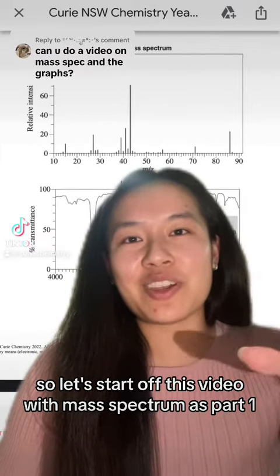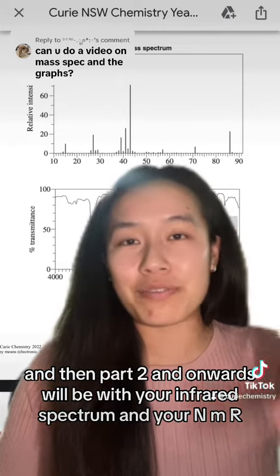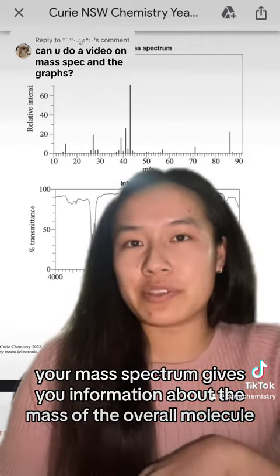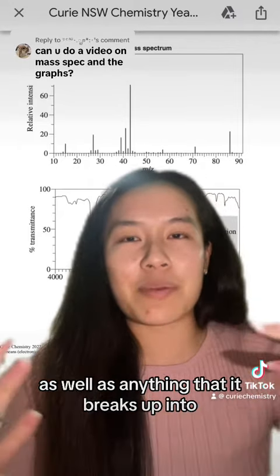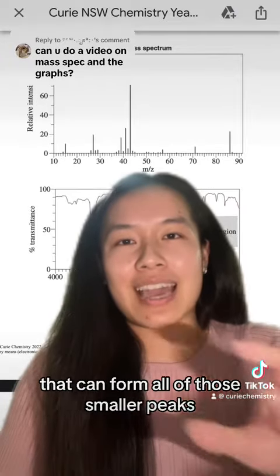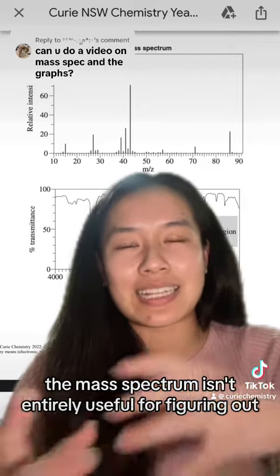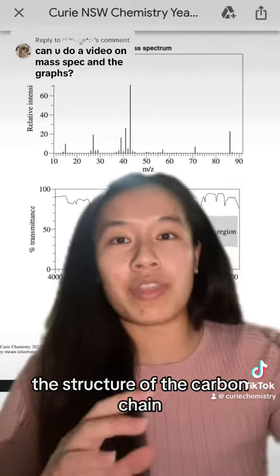So let's start off this video with mass spectrum as part 1, and then part 2 and onwards will be with your infrared spectrum and your NMR spectrum, so watch out for those. Your mass spectrum gives you information about the mass of the overall molecule as well as anything that it breaks up into. Because there's a bunch of different fragments that can form all of those smaller peaks, the mass spectrum isn't entirely useful for figuring out the structure of the carbon chain.